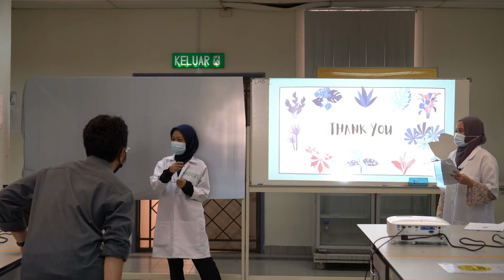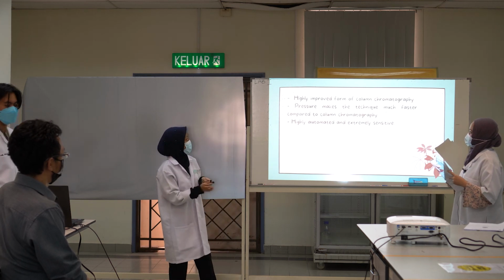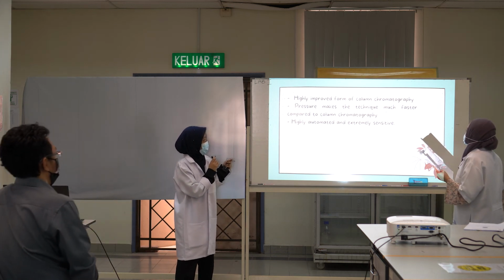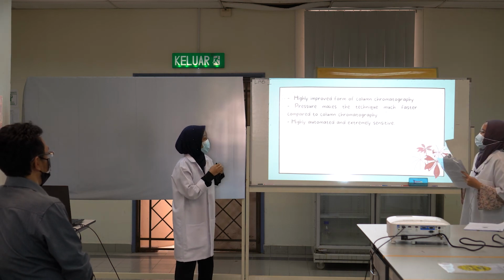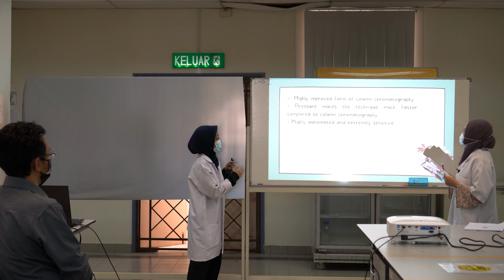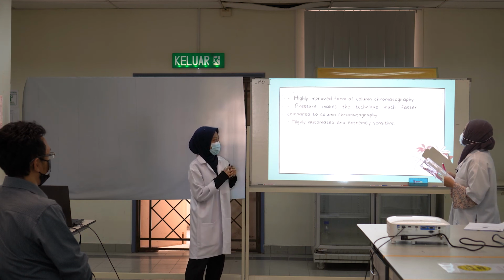Can we go to the previous slide, please? Okay. It said that HPLC is a highly improved form of column chromatography, right? Why do we prefer HPLC instead of column chromatography?